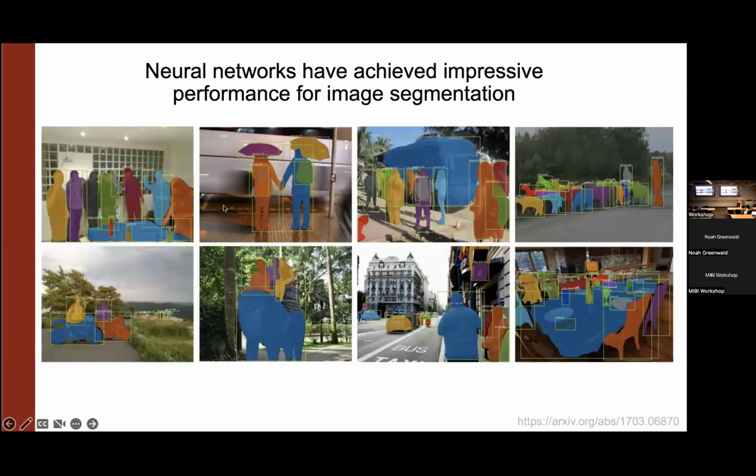And so this is where neural networks and deep learning come in. The key benefit of a deep learning algorithm is that it doesn't require feature extraction. It on its own will learn what the key features of the image are. And so all you have to do is give it the images and it gives you perfect predictions. What I'm showing here is a segmentation task where it's trying to identify each of the unique objects in the image. And what you can see is that it's identified the elephants, the people, the umbrellas, the backpacks, the little tiny strap of the backpack.